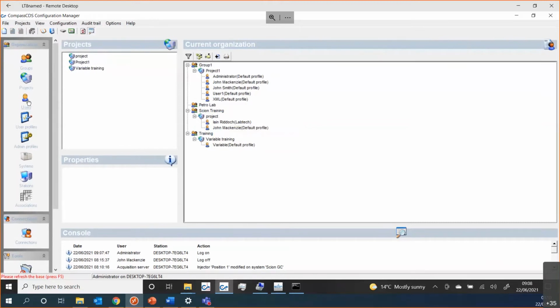If we have a look at the users, we can have a long list of users. Unlike other systems, we do not license the number of users that we have on the system. The number of users can be basically unlimited. That gives you some logistical problems, because if you're using it in a client server environment, all of those users have to have a Windows account as well, and that would involve CALs and that kind of thing.